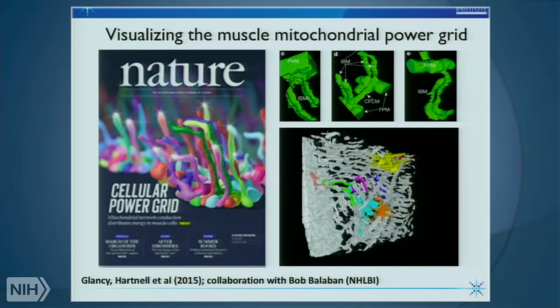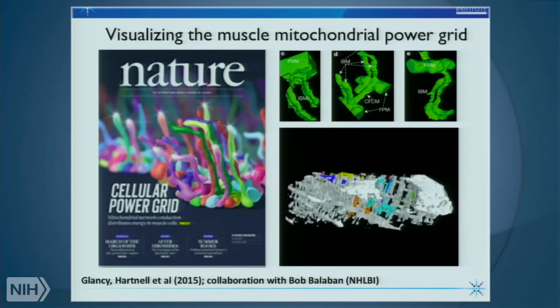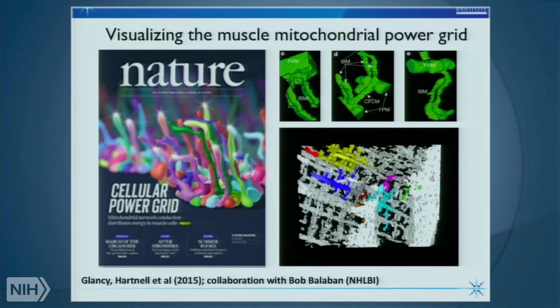And the fact that we have now a rich, deep insight into how these mitochondria might be organized in 3D. And the colors that you see in the lower right animation, each one of them corresponds to a single mitochondrion that's connected to others at these junctions. So this was certainly unexpected. Again, it came from the application of these technologies to important problems.